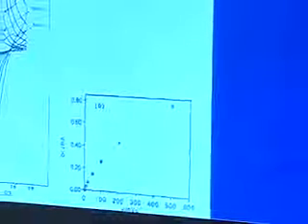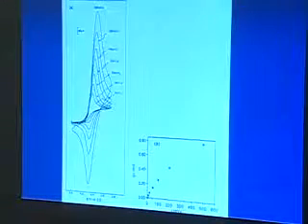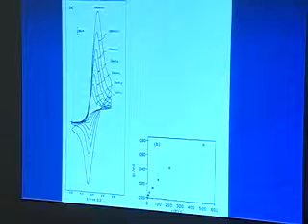And so we can conclude, based on that plot, that this is either a reversible or an irreversible system. Now, given that you're seeing two waves here, you might conclude that it's a reversible system, but in fact there are two components in there. There's a reversible component and an irreversible component, and it's the irreversible component that's giving rise to the scan rate dependence here. So that's how one might use that sort of data.